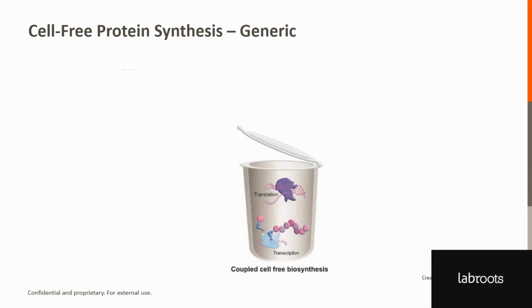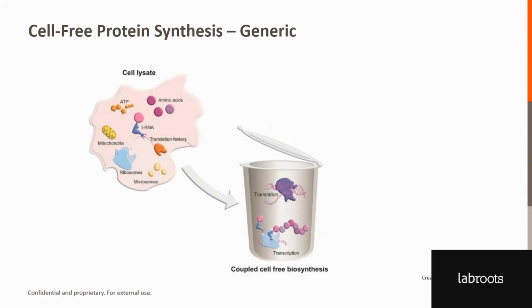So you're coupling transcription to translation. Transcription is normally driven by the T7 RNA polymerase in the literature, which takes your template DNA to produce the mRNA. And then you have the translational machinery to produce that protein. In many cases, this translational machinery comes from a lysate of cells.